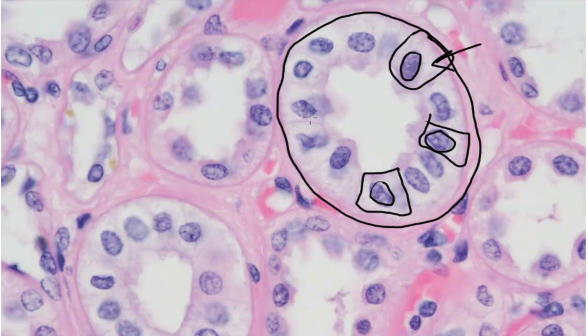Hopefully, you can see that these nuclei are roughly spherical. And where you can make out the edges of the cells, like for instance, right here, we can see this borderline running along here. Then, you can tell that the cell is cuboid. But even maybe down here on the bottom left side, where we can't see the borders between the cells. We can see that that nucleus is almost a perfect circle, indicating that this is a cuboidal epithelium.